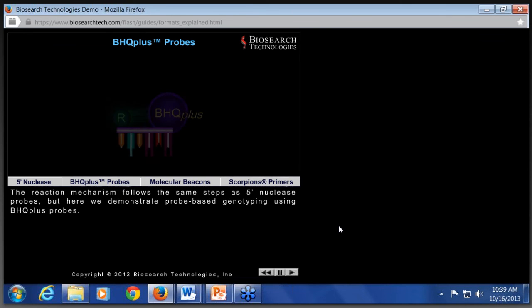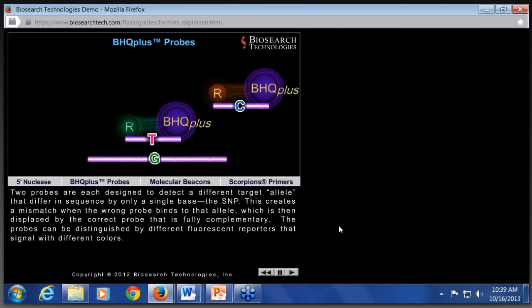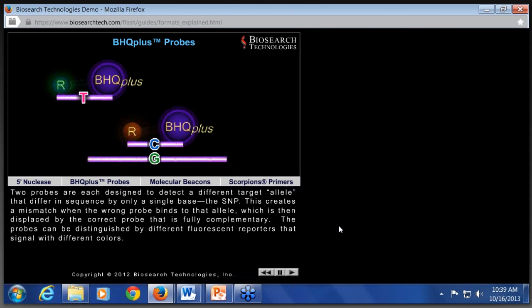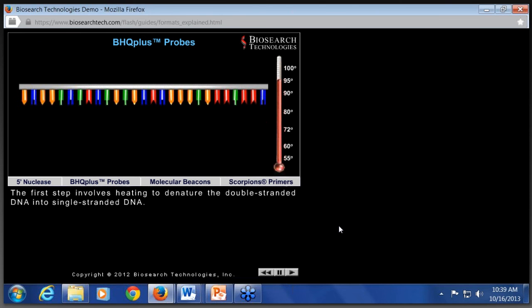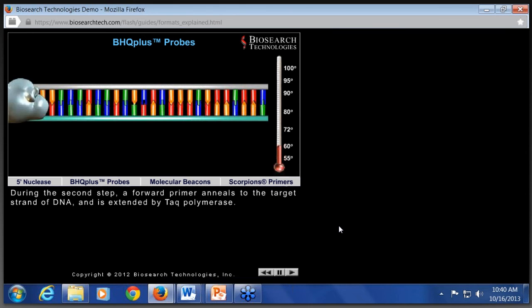Okay. And then they outcompete, and you generate a signal from the one with the correct match, and that's how you distinguish which, as you're showing there. Yeah, exactly. And then you do a post-PCR read, which is the allelic discrimination that does the cluster plot. So it should, in theory, cluster towards whether it's homozygous for one allele, homozygous for the other allele, or heterozygous for both. You could always confirm that if you have positive controls for each allele that you could run.